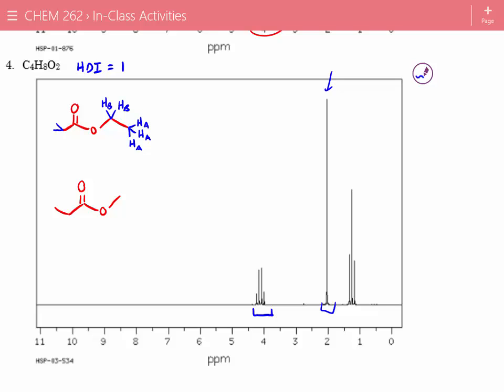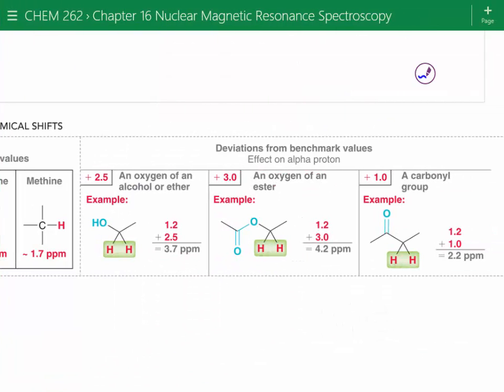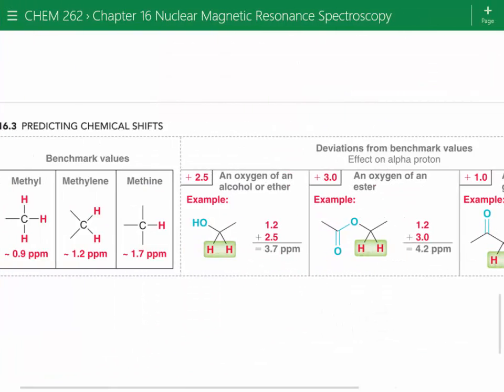And I'll call this one HC. If we look at the protons for HC, they have no 3-bond neighbors, which could correspond to the singlet right around 2 ppm. And another good way of checking is these are protons attached to a carbon directly next to a ketone. So if we go back and pull up our table, we can say, all right, where do they show up typically if we're next to a ketone?